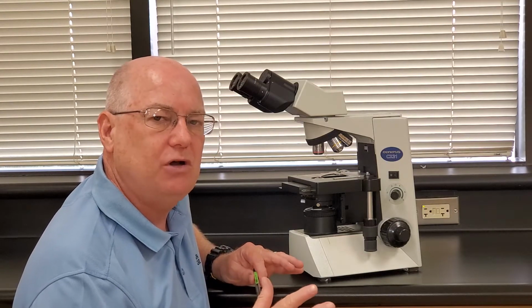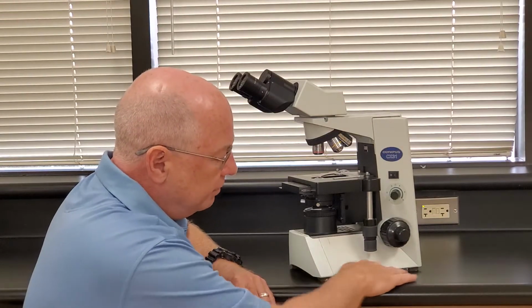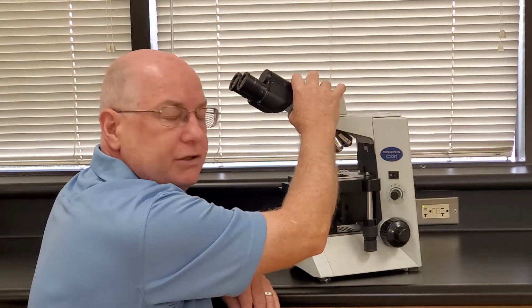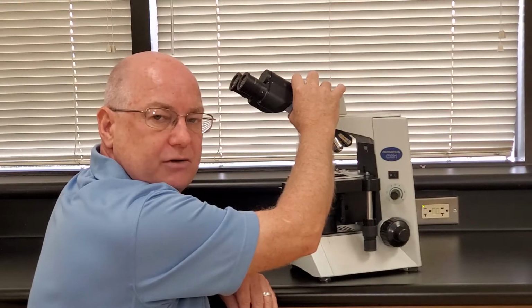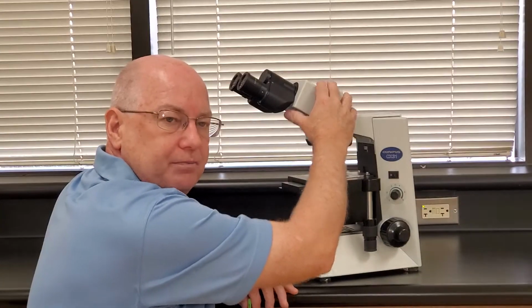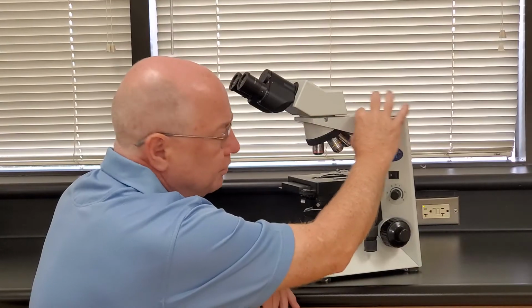Now, some basics are, obviously the bottom of the microscope is the base. This would be called the body of the microscope, and then this part is sometimes referred to as the head of the microscope. I'm not going to ask you for the base, the body, or the head, okay? And some people refer to this part as the arm or the neck of the scope, depending on who you have, and I'm not going to do that. Here are the parts that are important for you to know.